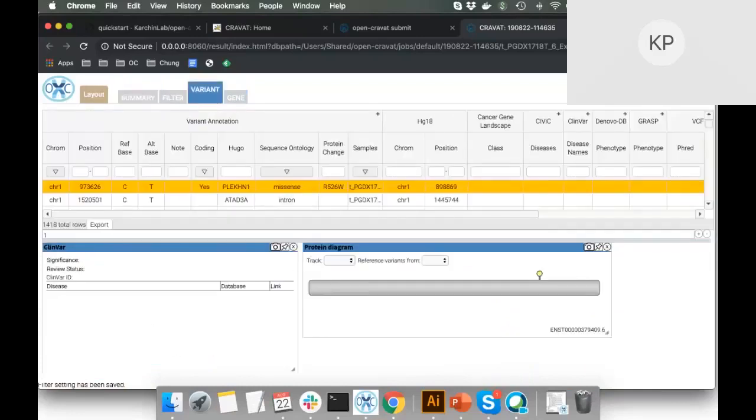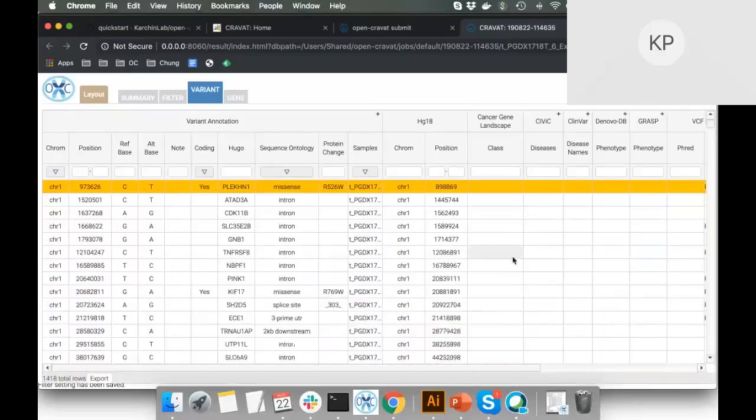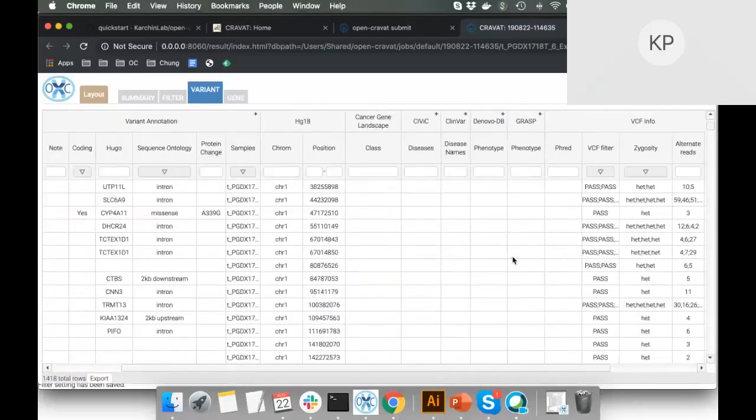So I wanted to briefly explain what this button does. I have a 13-inch computer. It's quite small. I don't really have trouble using the interface though, mostly probably because I'm used to it. But for those of us who would prefer to have less going on here, this switch lets you toggle between only viewing the Excel style table or only viewing widgets.